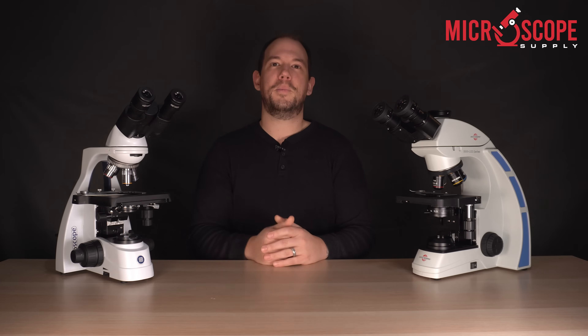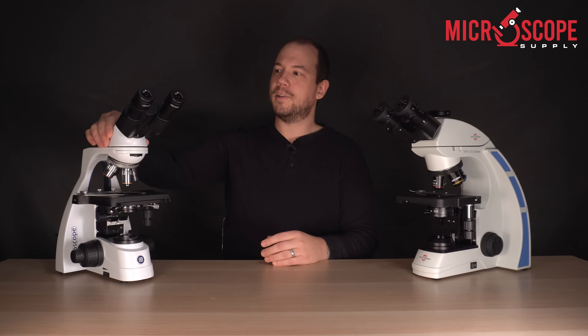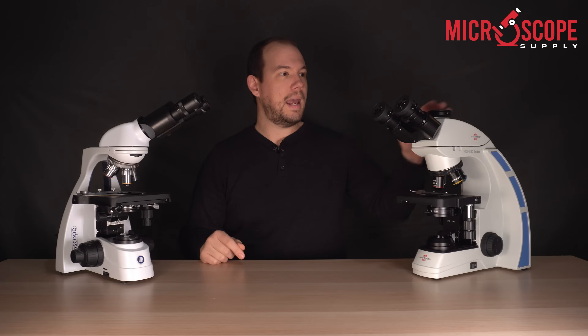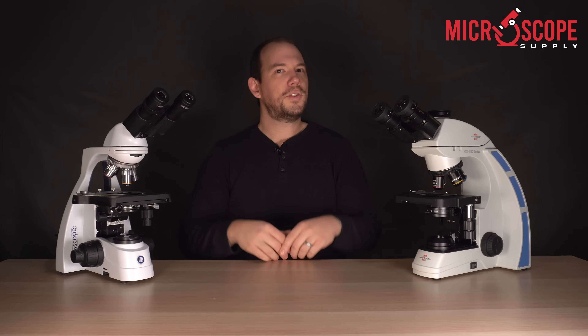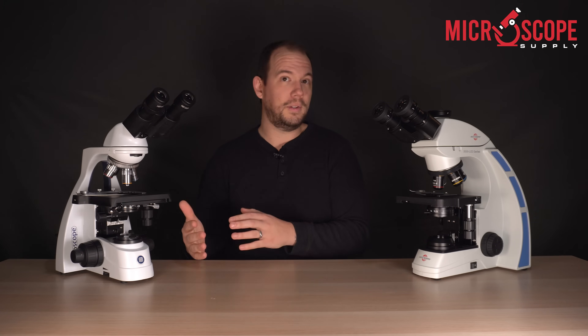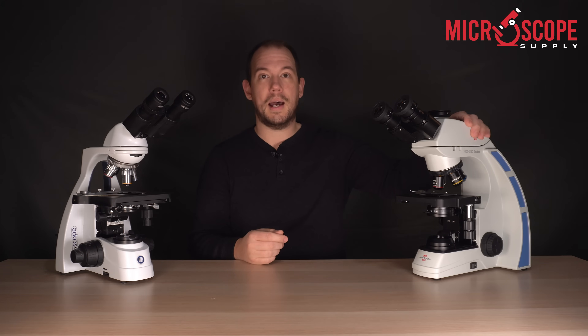The third thing to consider when purchasing a compound microscope would be the viewing head. Our B-scope microscope features a binocular viewing head, and the Accuscope 3000 LED a trinocular. This one is fairly straightforward: do you need to use a camera to capture images? Do you think you'll need a camera in the future? If so, you'll want to go with the trinocular head.